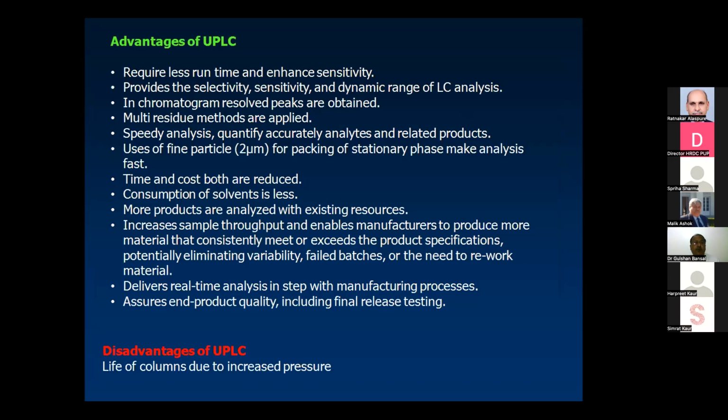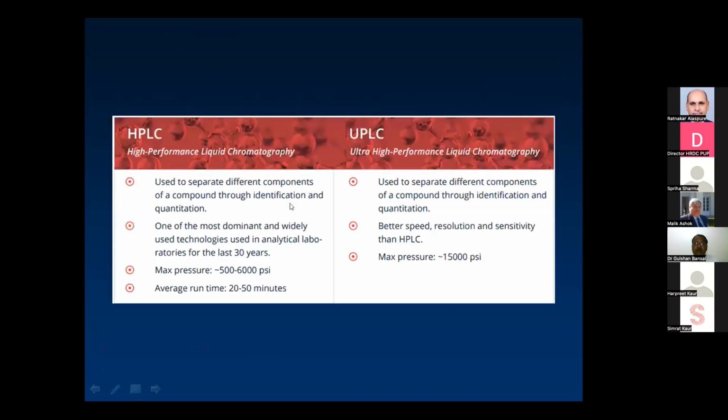So these are some advantages of UPLC. They require less runtime, they have enhanced sensitivity, they provide better selectivity and a dynamic range of LC analysis. Resolution is better, multi-residue methods are applied, speed analysis, quantify accurately analytes and related products. The consumption of solvent is very less.